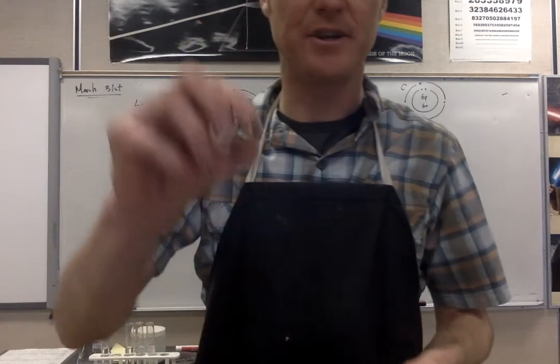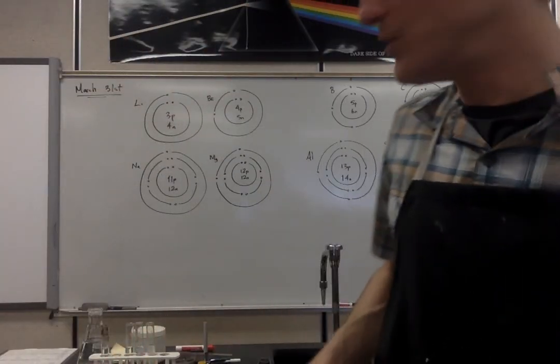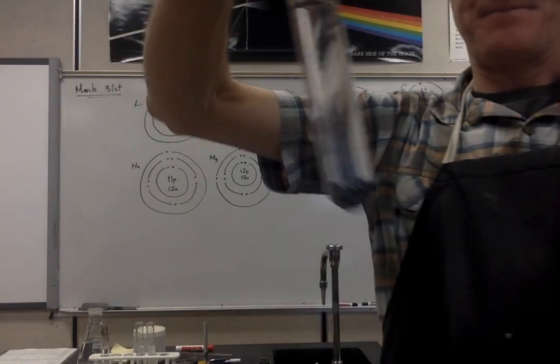I'm also going to add this little bit of carbon to the acid back here. Now let's look to see what things are doing and what's happening in the water.